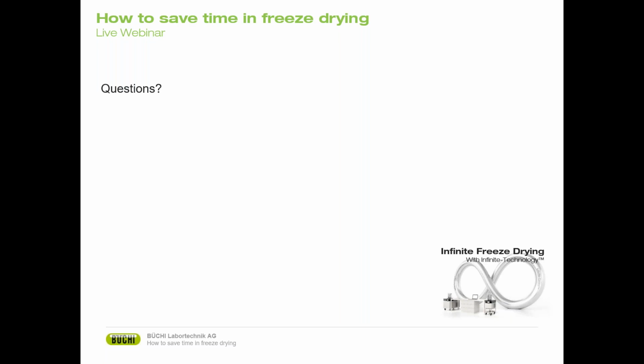Okay, and then one question for Moritz. The presentation is only about water-based systems. Can comparative endpoint detection also be used for organic solvents? Yeah, so in general it can. The whole limitation is that you need a solvent with a high enough difference in heat conductivity compared to nitrogen. But otherwise, of course, you can also use other systems.